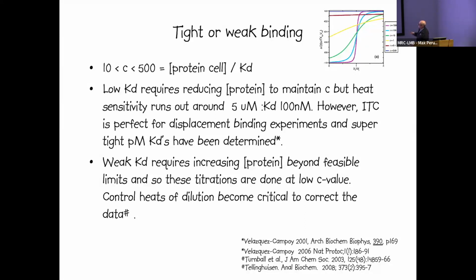However, I would point out that because of its non-optical nature, ITC is a perfect technique for doing displacement binding experiments, meaning that you would bind a weaker binding ligand and then displace that weaker binding ligand with your tighter binding ligand that you can't measure directly in one measurement. Using displacement methods, really super tight KDs, picomolar, have been determined and quantified quite accurately.